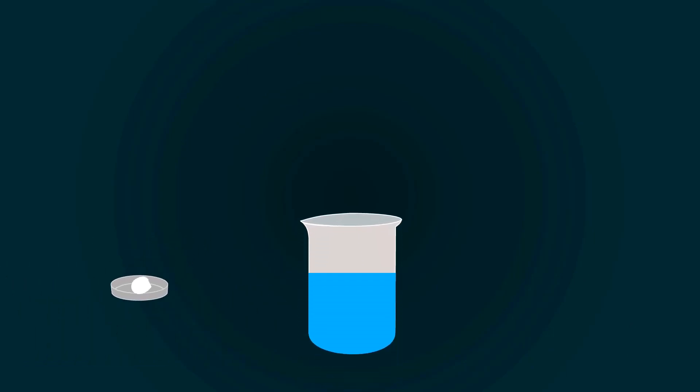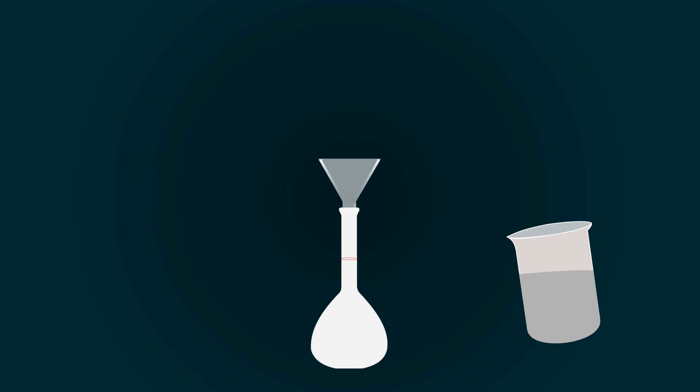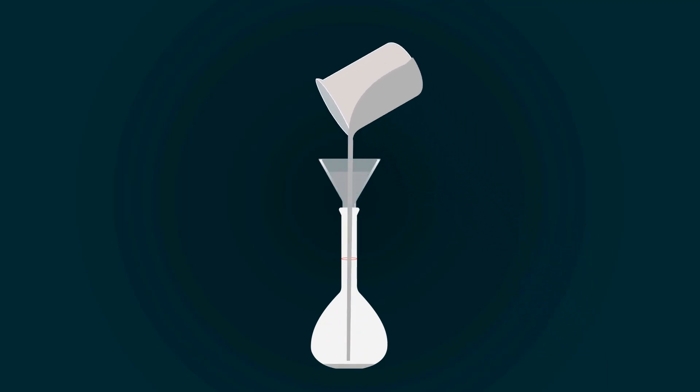Now, add the potassium hydroxide into the distilled water. You can take distilled water up to 600 milliliters for mixing. You have to make homogeneous mixture. Now pour all the solution into the volumetric flask with the help of the funnel.